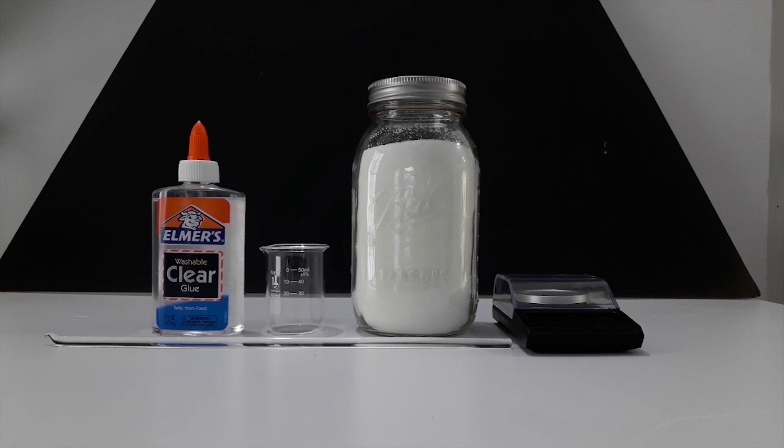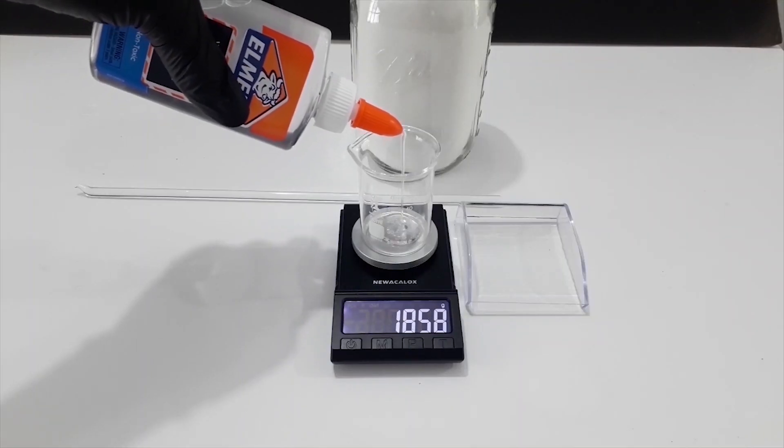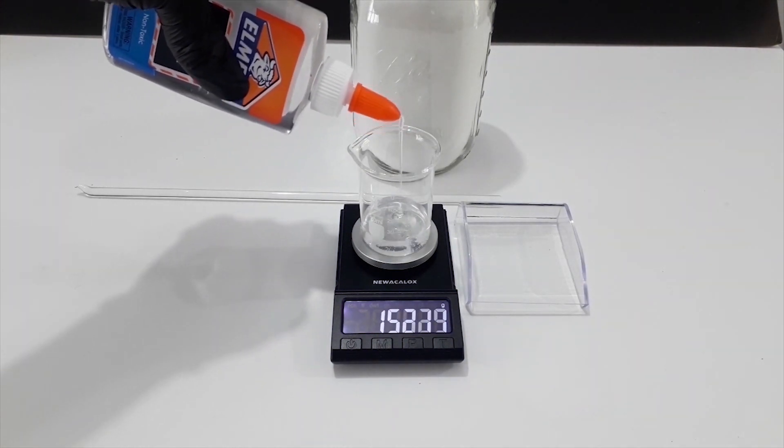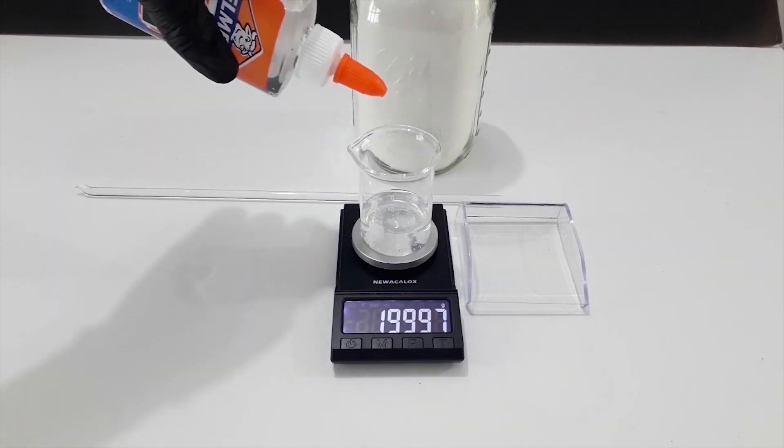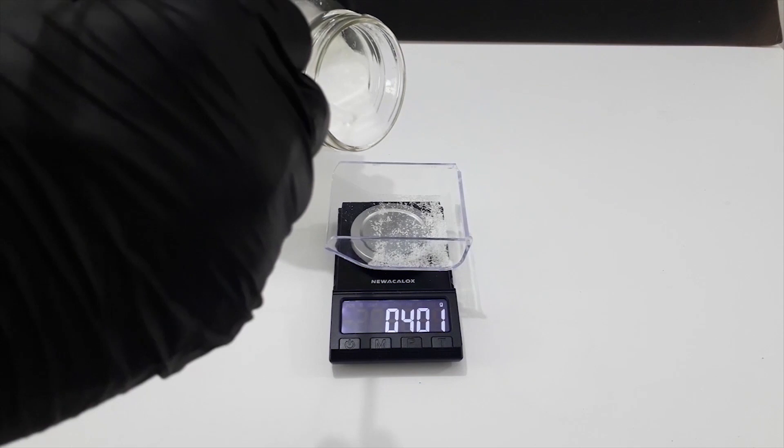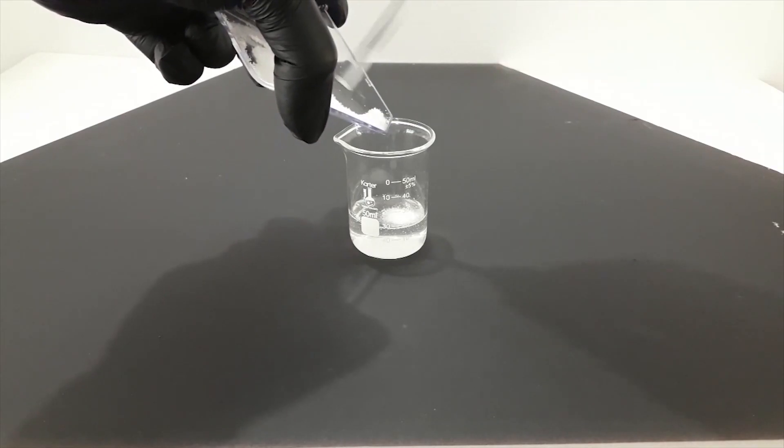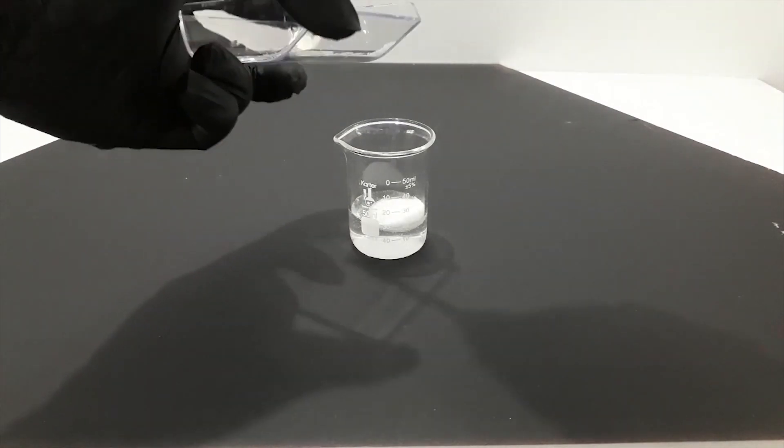Now we will create the ion exchange resin layer. To do this, all we need is clear PVA glue, citric acid, a scale, and something to stir it with. White glue will not work for this purpose as it doesn't contain polyvinyl alcohol but instead polyvinyl acetate which is non-reactive. The ratio of PVA glue to citric acid is 4 to 1. I'm using 20 grams of PVA glue followed by 5 grams of citric acid. All of the citric acid is then added to the glue and stirred until it is fully dissolved.